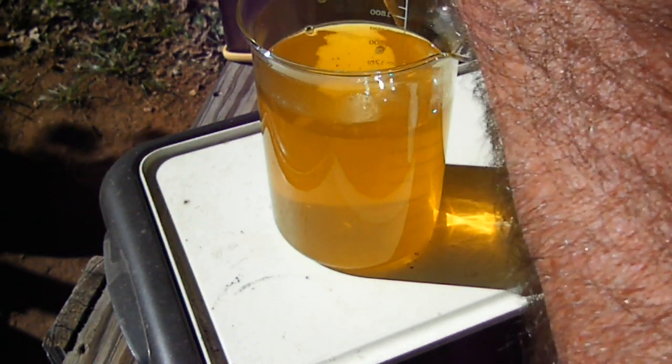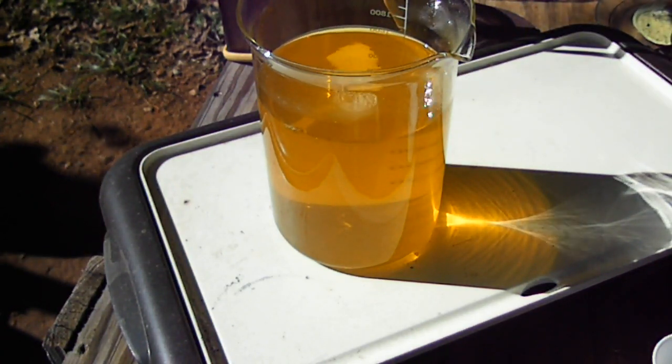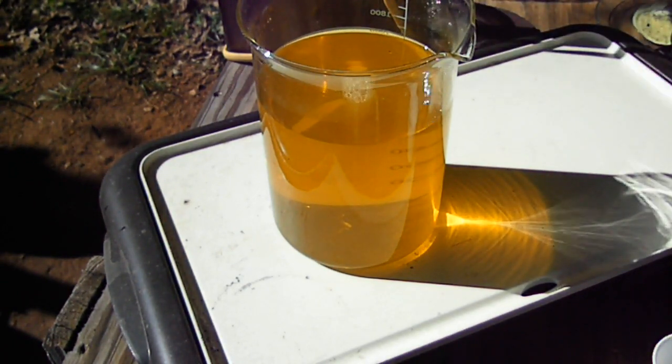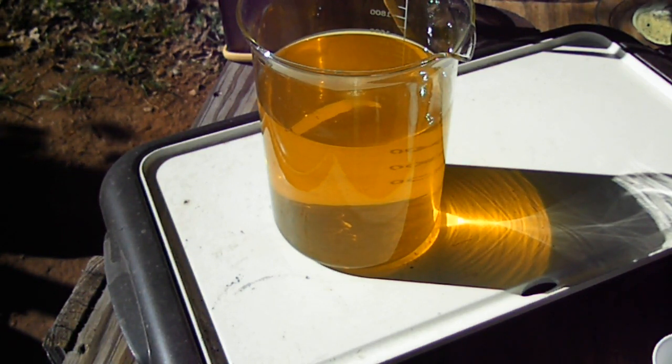I'm just going to let that sit - like I said most of that's probably iron. We'll just leave that be and see what happens tomorrow. If we've got some gold in there we will fish it out, and in the meantime we're going to continue filtering over here. We will be back at you when we do the big drop, which unfortunately because the solution is so dark you probably won't see much happening with that one either.